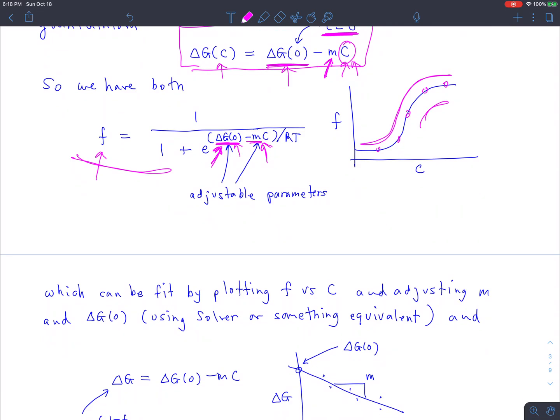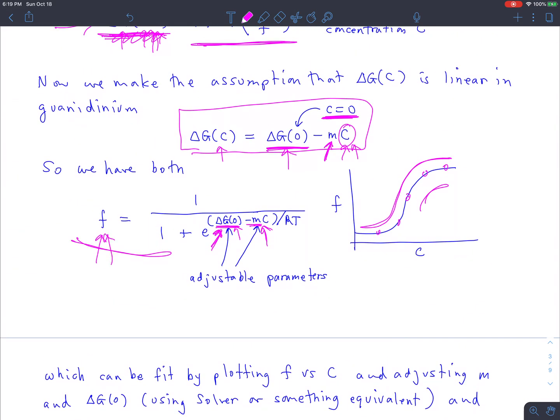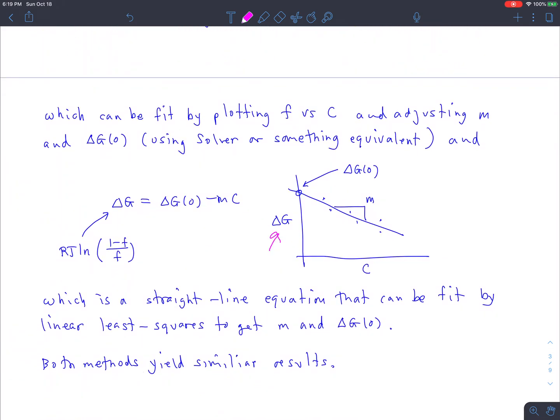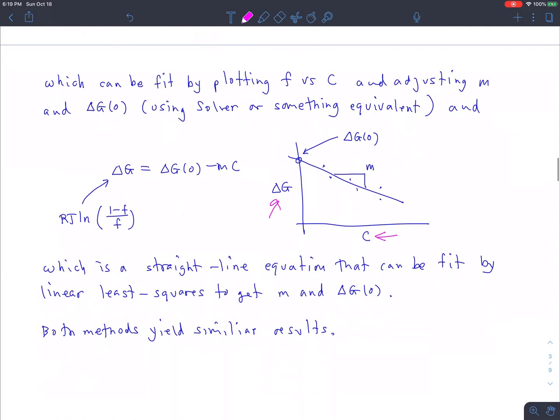So that's one approach. And the second approach is that instead of plotting the fraction itself, we solve for delta G. We use this relationship, and we just plot delta G as a function of concentration, and then we should get a straight line, right? According to this relationship here, delta G versus concentration should be a straight line. The intercept should be the quantity we want, and the slope, that M parameter, should be the negative of the slope. And so by taking the slope value, we get an estimate for M, and by looking at the intercept, we get an estimate for G0.